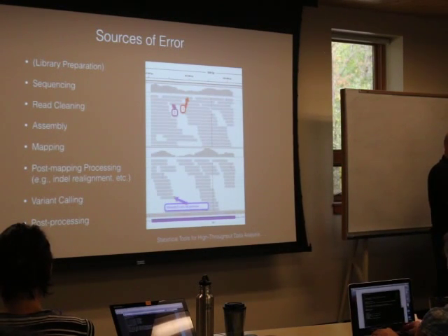And yeah, so just to wrap up post-processing, just filtering, making sure you have really vetted sets of variants, and other people speak about that.